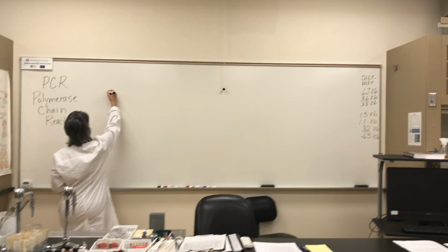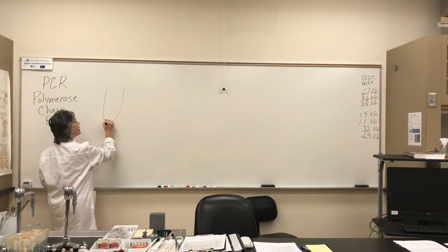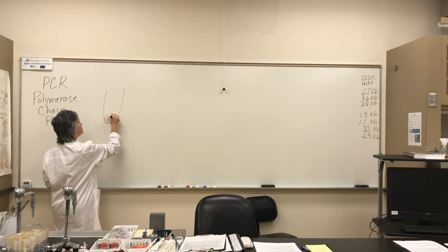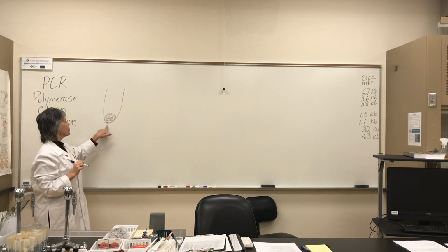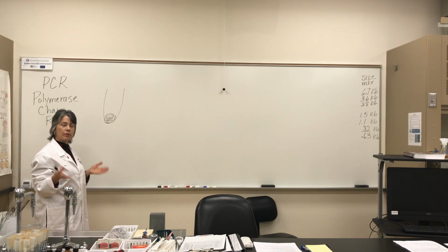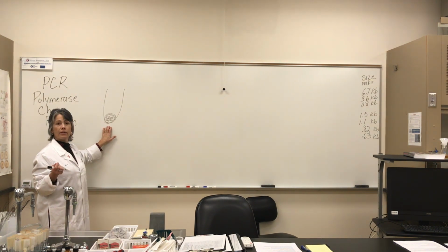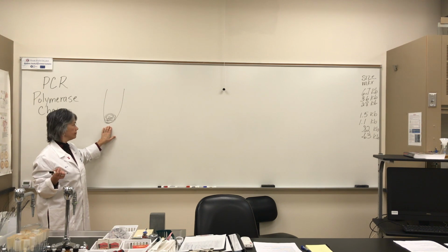Say we've got a tube. I'm going to draw a giant size tube. We've got DNA in it. Say this was from cheek cells. Swab inside a cheek, do a DNA prep, which really isn't too complicated and can be done within an hour. And you end up with a sample of DNA from a patient.